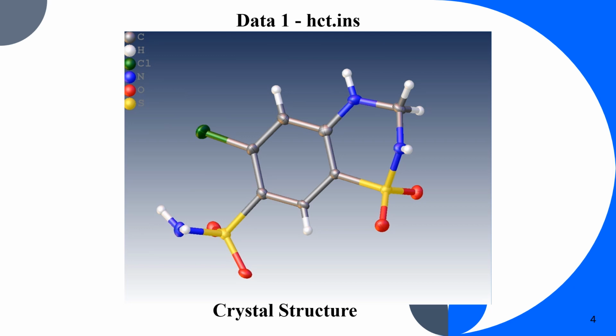That is because of Uiso, the isotropic displacement parameter, which we have learned about during the Debye-Waller factor, where we consider the atomic vibration that will lead to the different sizes, the role of ADPs, and this is the crystal structure basically.